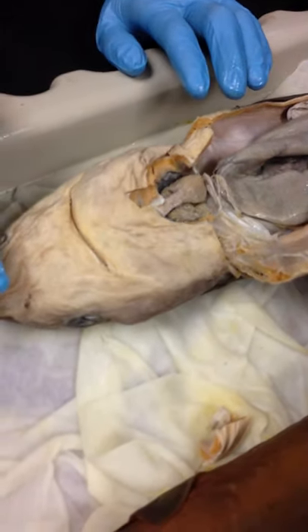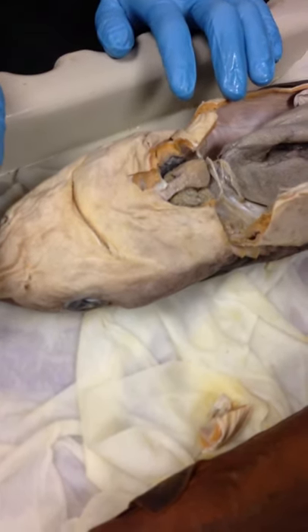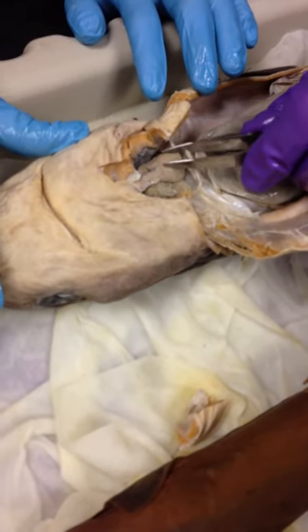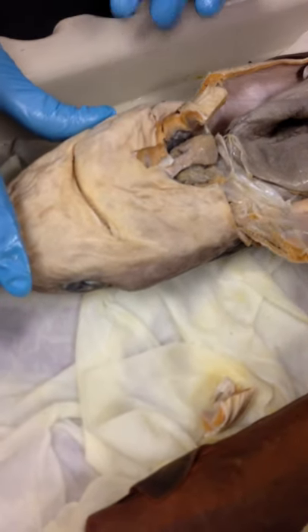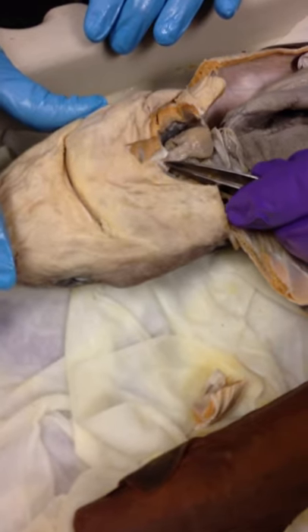It's analogous to the diaphragm. It's not muscular. It doesn't breathe with it. It's got no lungs. But it does act as a separator between the abdominal cavity in the pericardial cavity. Here's the heart. Remember I said the big muscly part of the heart is called the ventricle. Excellent. And here's the conus arteriosus emerging anteriorly from the ventricle.